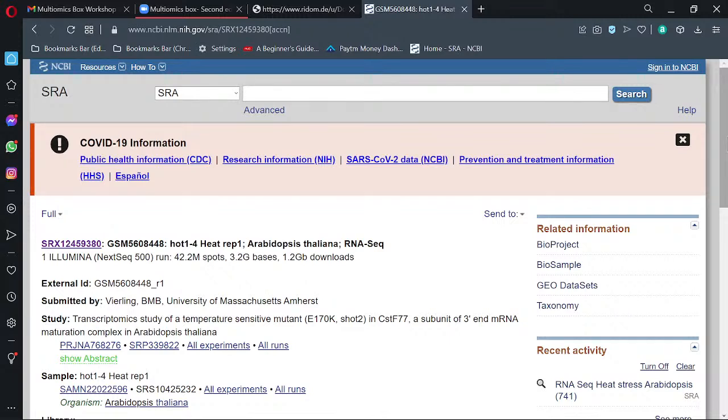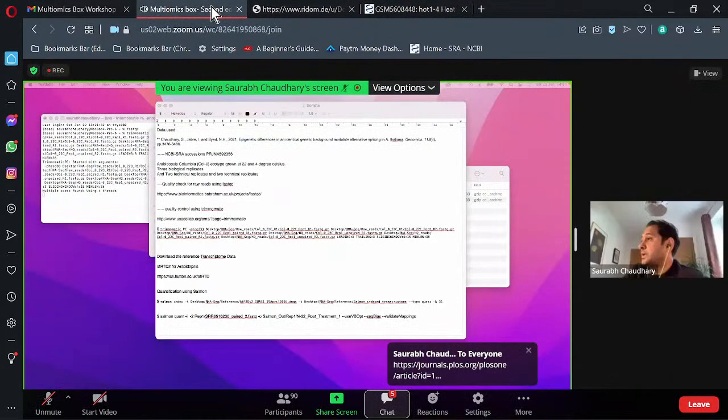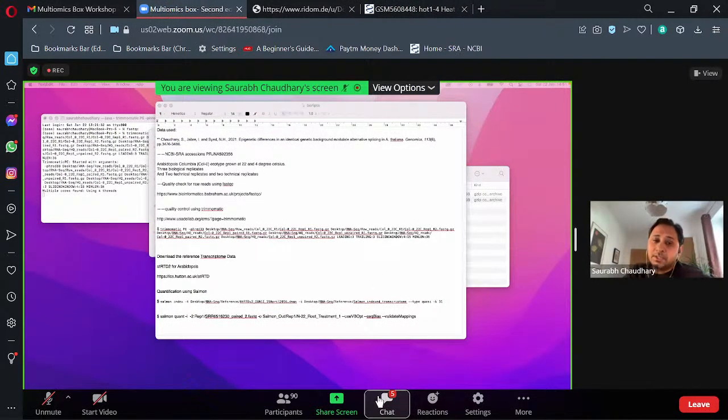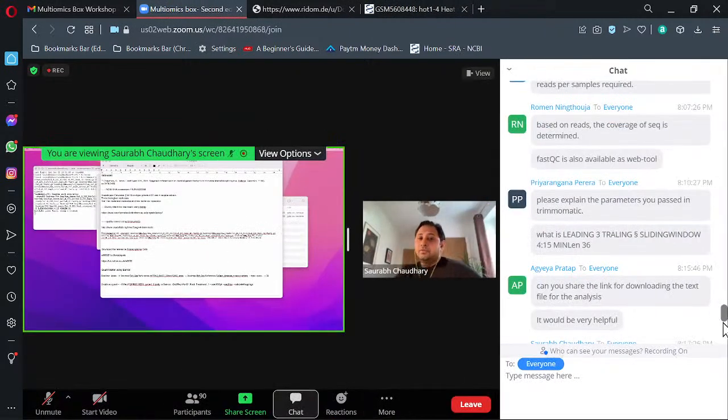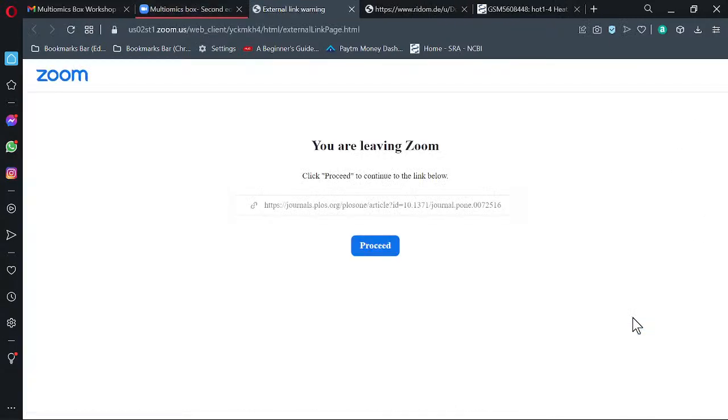We used six de novo assemblers, and you can use any one of them according to your requirement. You can go through this paper, where we optimized the de novo assembly. Thank you, Dr. Sir. Yeah, we commonly use Trinity and SOAPdenovo.